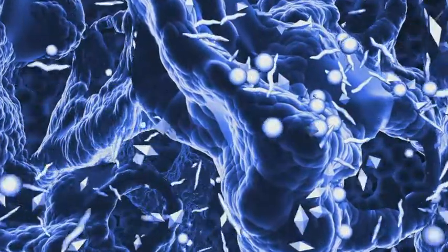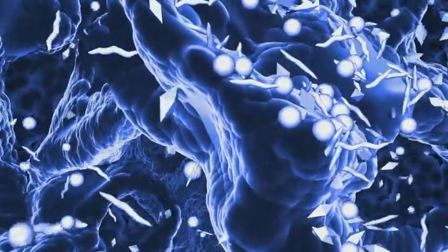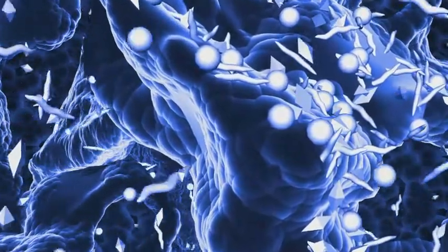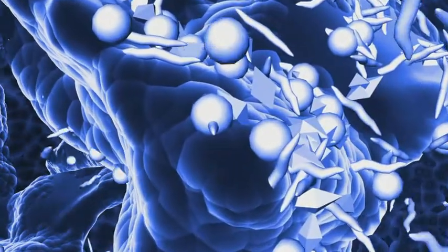What you see here is a representation of our hydrophilic Teflon membrane. This membrane is chemically compatible with a broad range of solvents and buffers, has extremely low analyte binding, and is low in extractables.